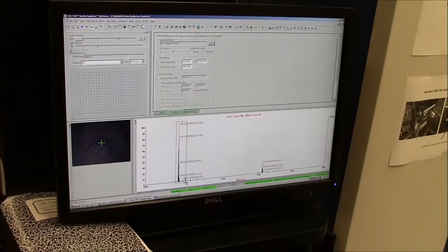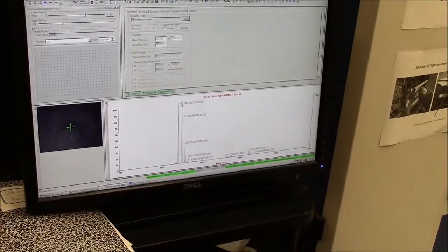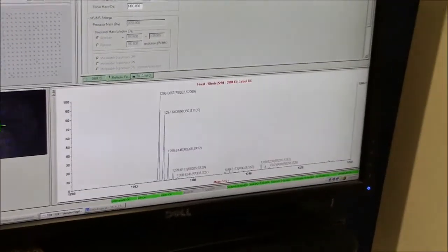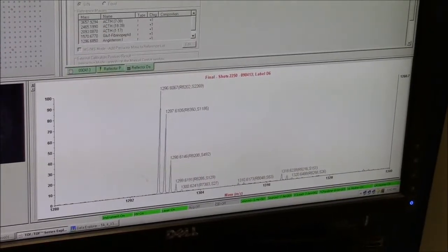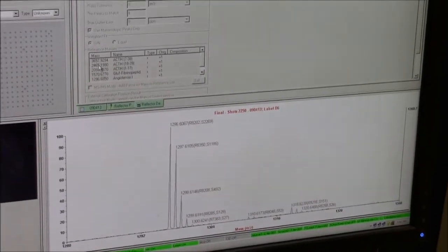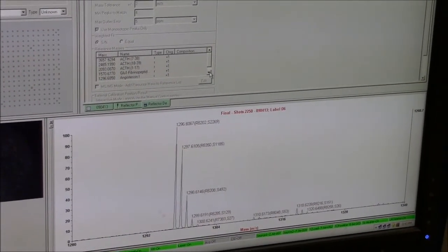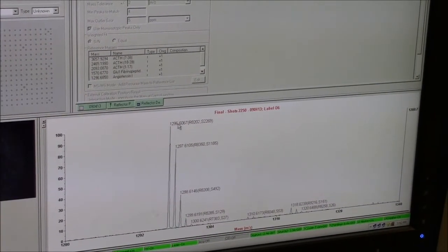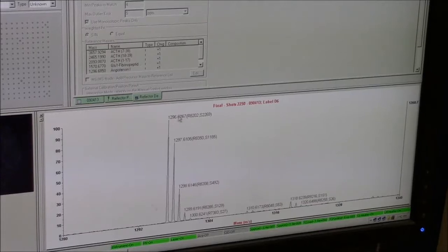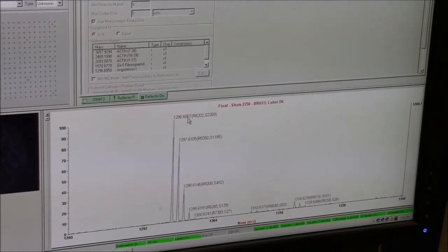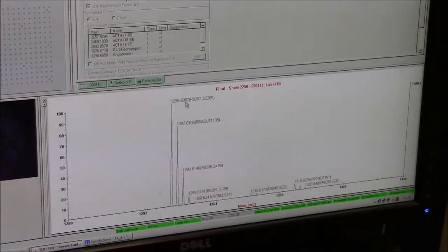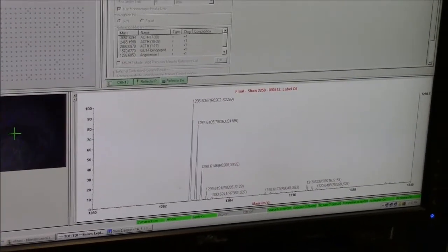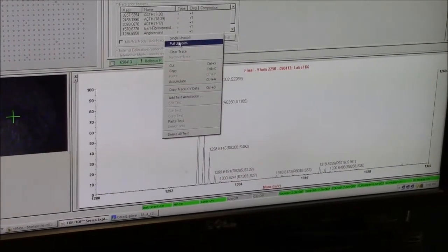You can check that it's a single charge state. If you go into here, you can see I have my calibration standards. So this is angiotensin 1, right? Uncalibrated. Even uncalibrated, this instrument is within a 0.1 Dalton. So it's a pretty sharp instrument. So that's pretty nice.